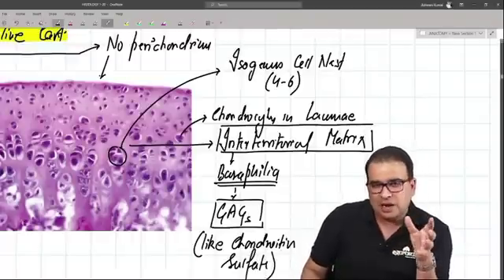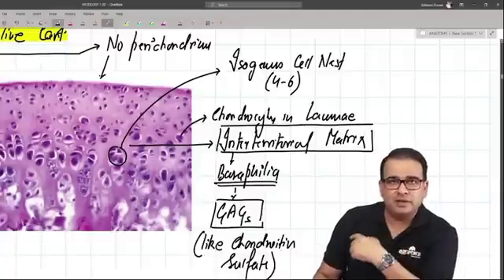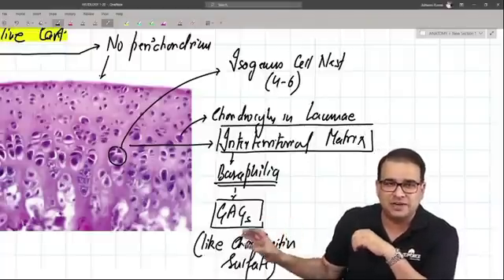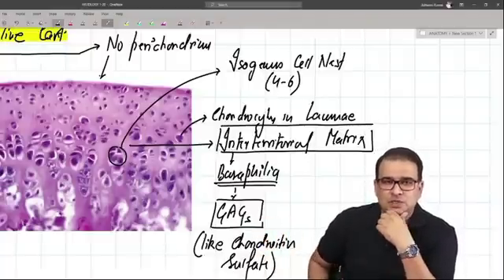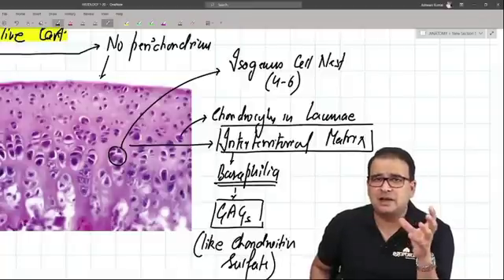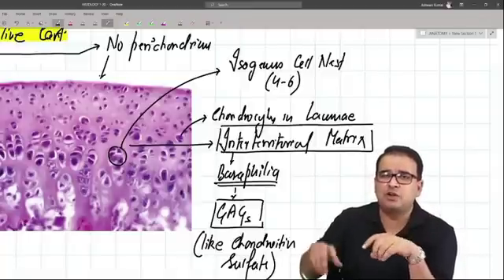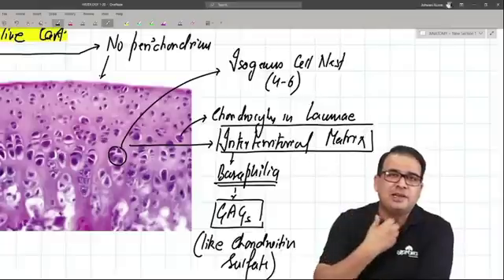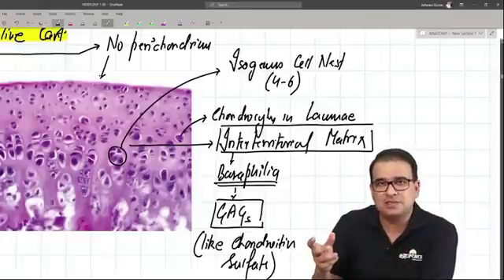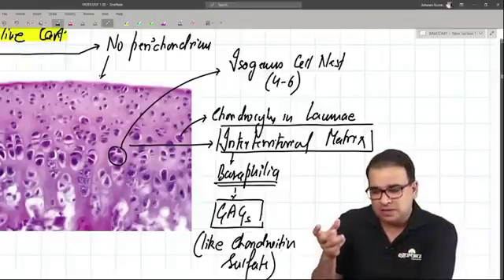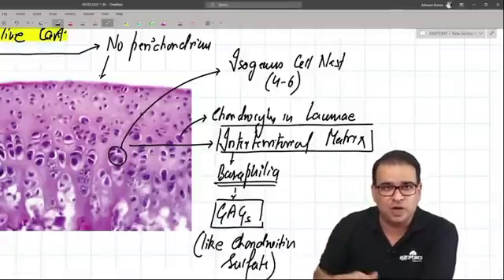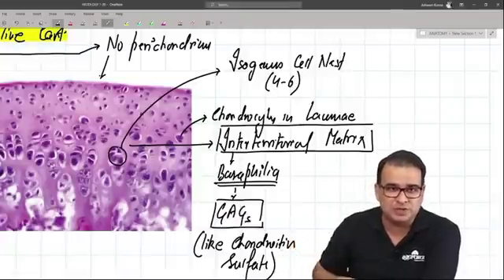To summarize: in hyaline cartilage we do have perichondrium, but not here — it is articular hyaline cartilage, so no perichondrium. There is a calcified zone present toward the basal part. In a typical hyaline cartilage, like that of the trachea, you will see fibrous and cellular layers of perichondrium on both sides, but not here — you have a calcified zone on the other side instead.